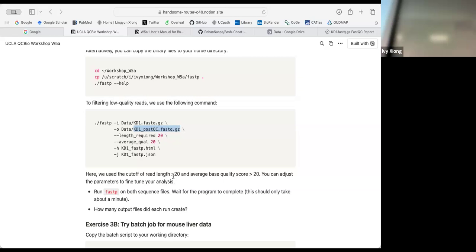Did you copy and paste it? You copy the whole thing, then you go to the... yeah, okay, enter. But just the K one. Oh, right, but how do I do that?